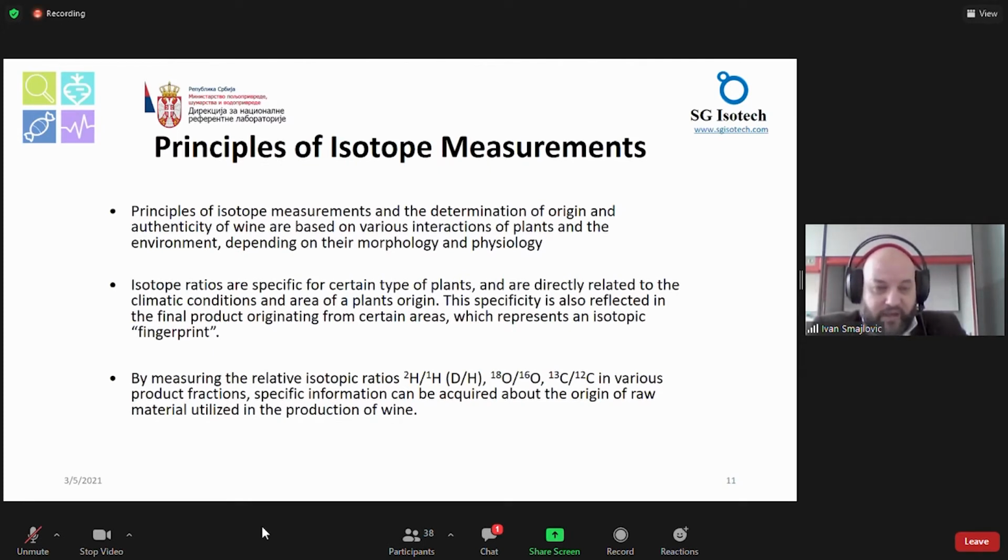So it can be H2O, it can be HDO, so hydrogen deuterium oxygen. It can be H2 16O, H2 17O, H2 18O. It can be D2O. So there are different fractions of water, isotopically speaking.